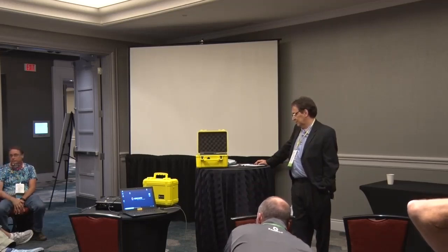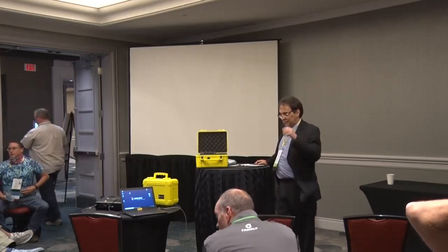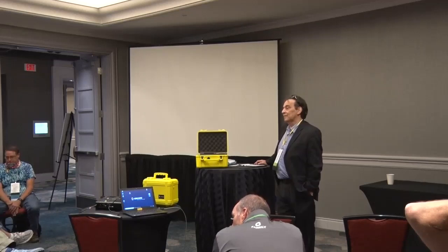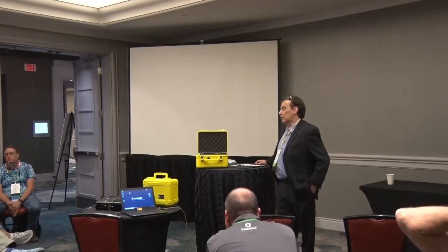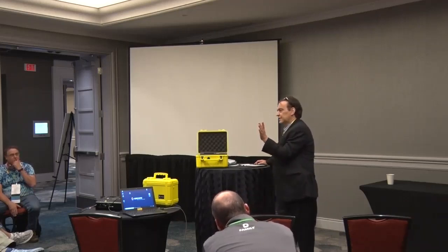Now, I have a Johnson sniffer, and usually I take either 3 or 4 minute, 1 minute readings at each spot. Do I do the same with this, or do I just leave it in there and let it count until it equalizes? Count until it equalizes. The cell basically flushes out once in 15 seconds or so.